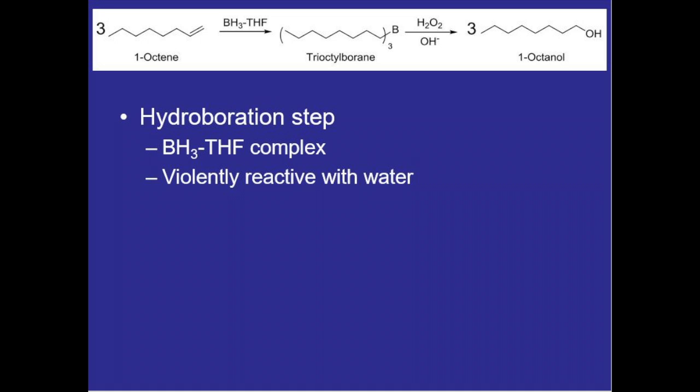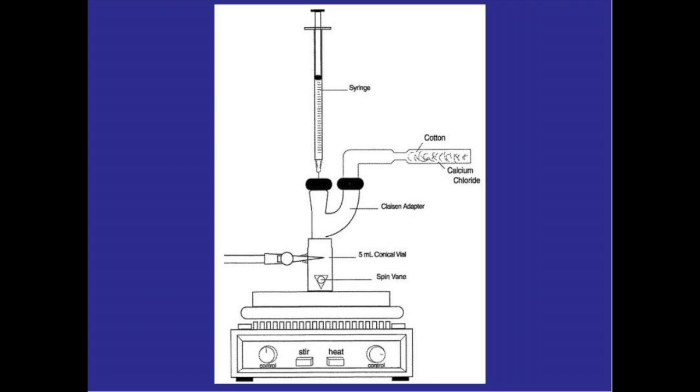This complex is violently reactive with water, so we want to make sure that our reaction vessel is dry. So we're going to put our glassware in an oven to make sure no water is on it. And we'll set up our reaction apparatus like so.